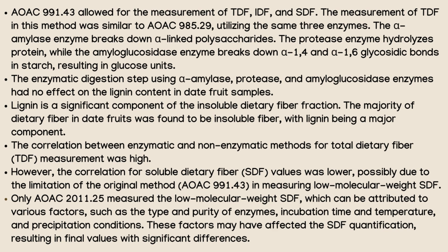Only AOAC 2011.25 measures low molecular weight soluble dietary fiber SDF, influenced by factors like enzyme type, purity, incubation conditions, and precipitation, leading to significant differences in SDF quantification compared to other methods.